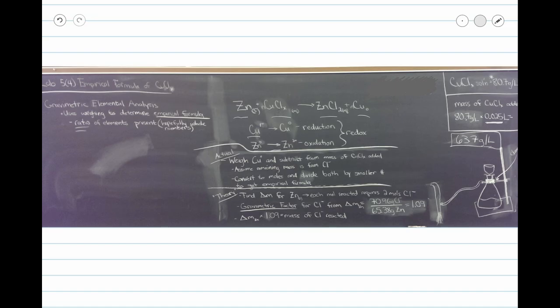So in our experiment today, solid zinc metal will be reacted with an aqueous solution of copper chloride. So we have Zn0. Well, it's not Zn oxide. It should be a little zero. There you go. Because it's neutral. And then CuClx.